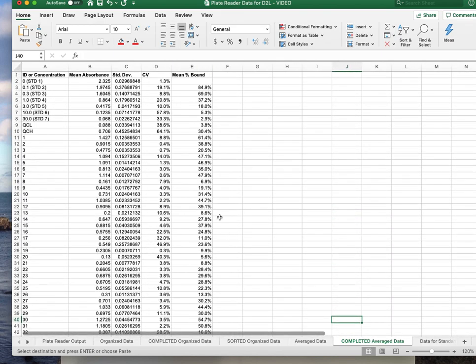I filled in the percent bound column. We're going to talk about how to do that in a second.